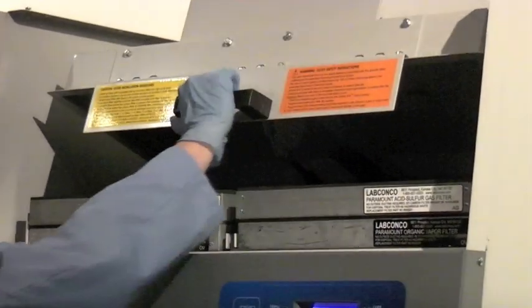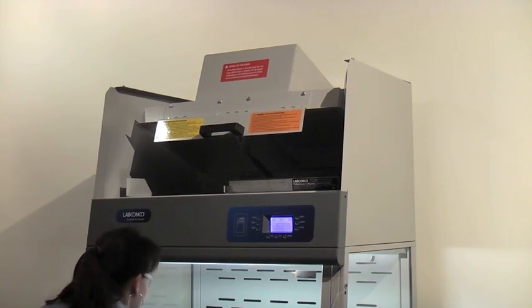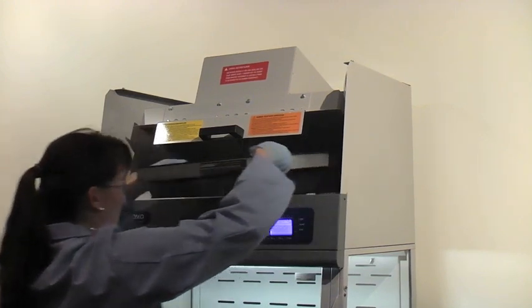If you are installing filters on a new Paramount, remove the cardboard packing. If replacing old filters, remove the used filters and dispose of according to local ordinances.